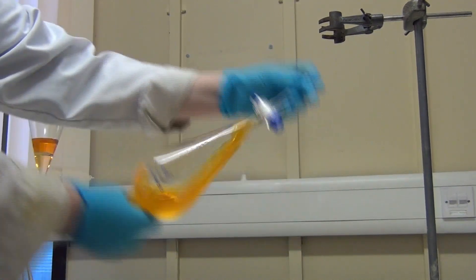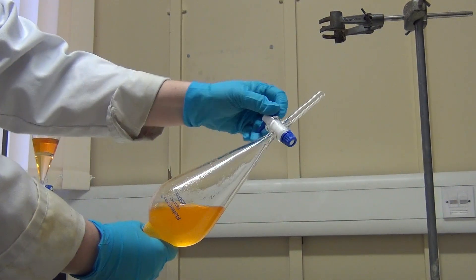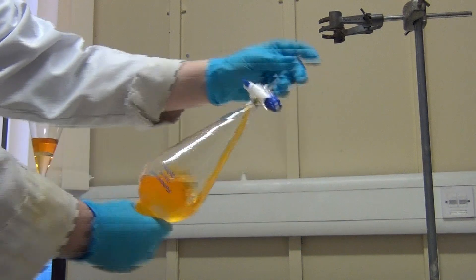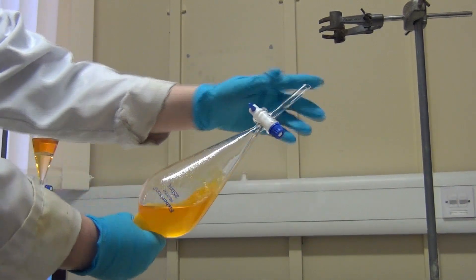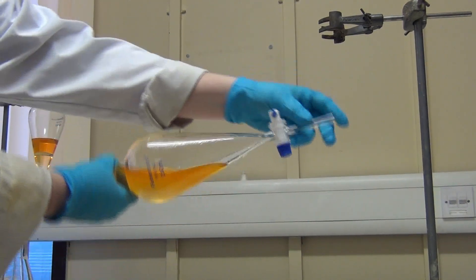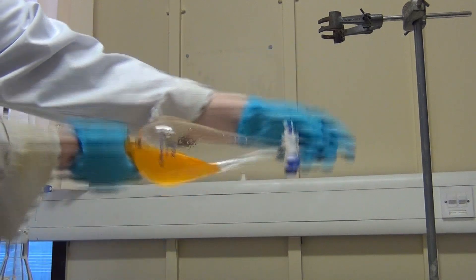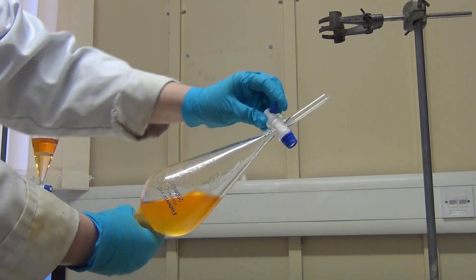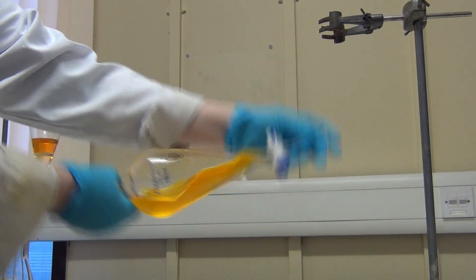Then, using both hands, invert the funnel two to three times before opening the tap to release the pressure again. To ensure maximum mixing and maximum separation, you should repeat the process of two to three inversions, followed by the opening of the tap another five to ten times.